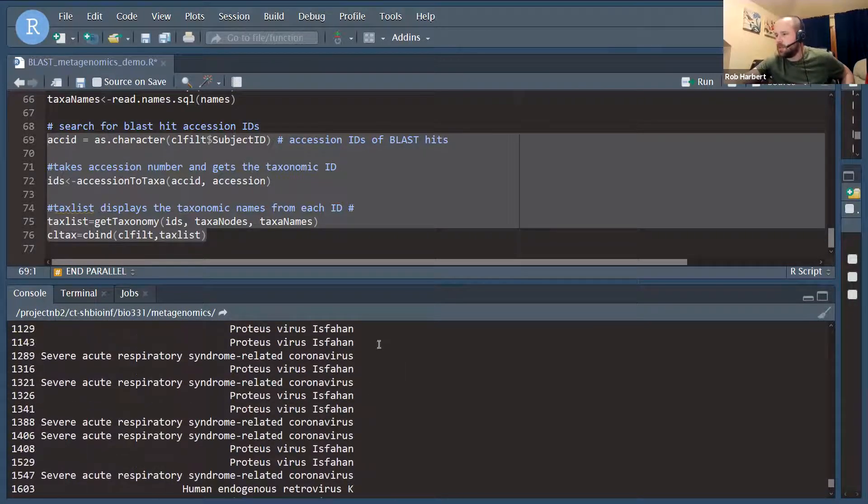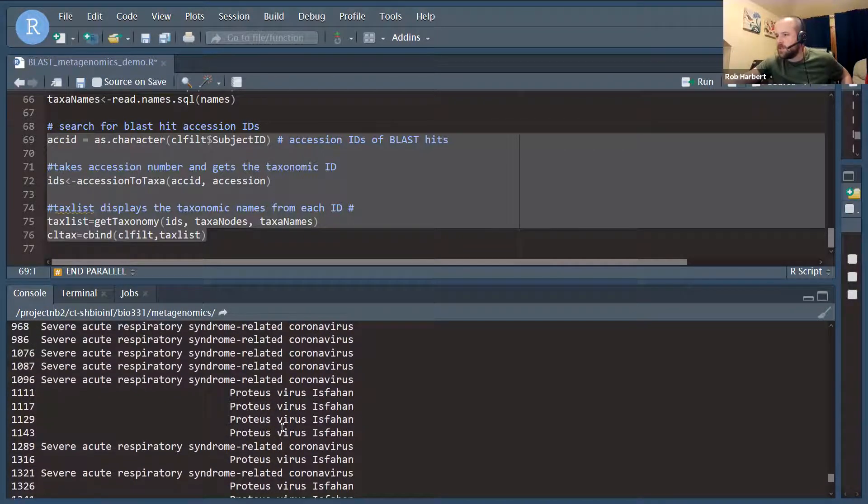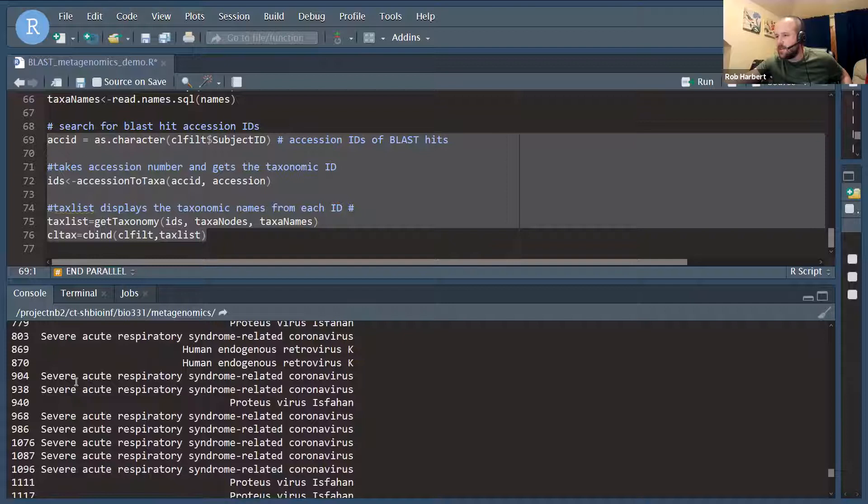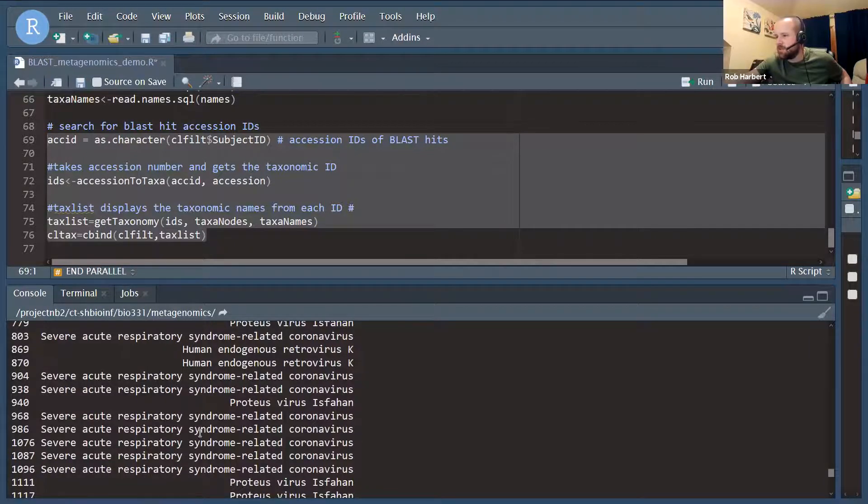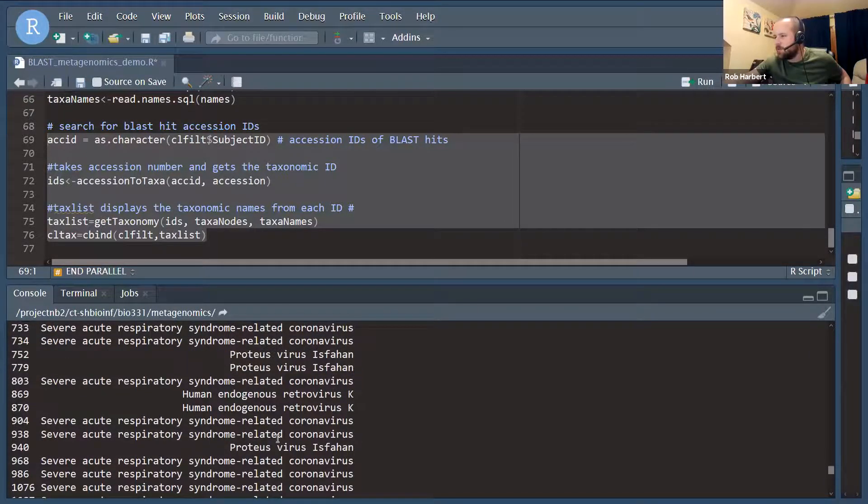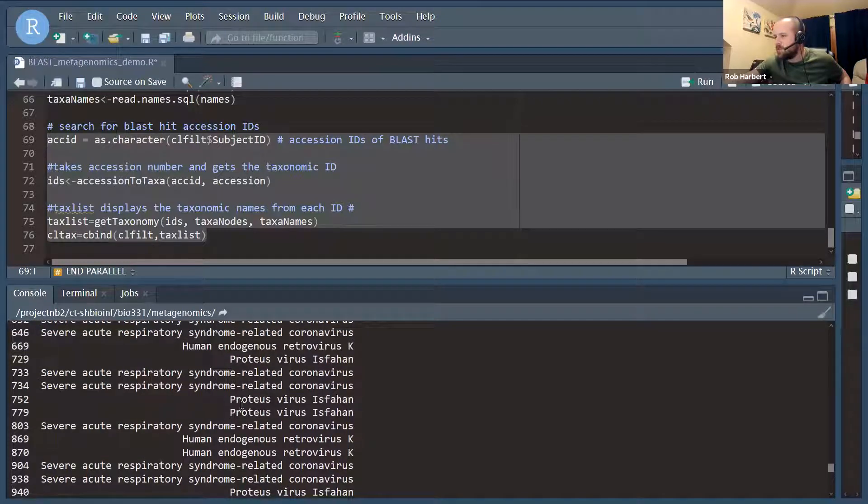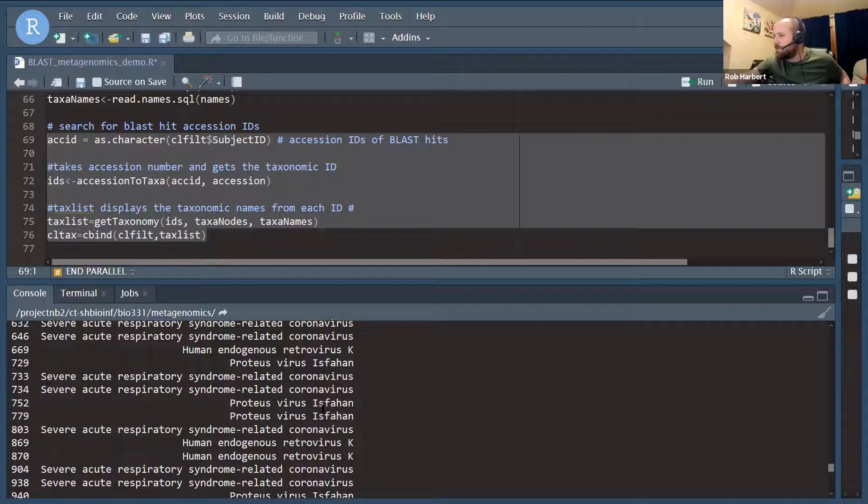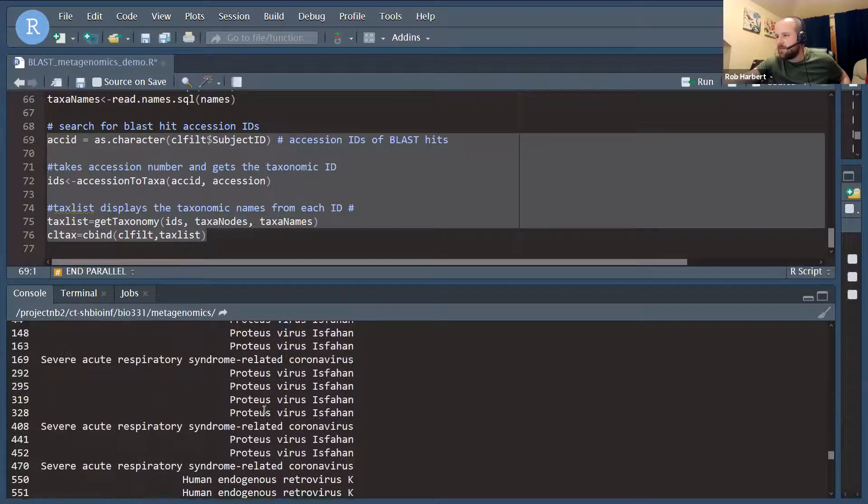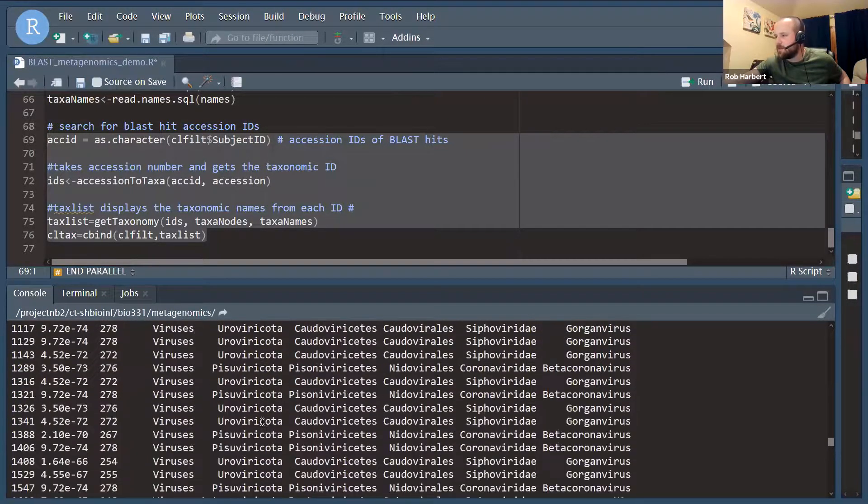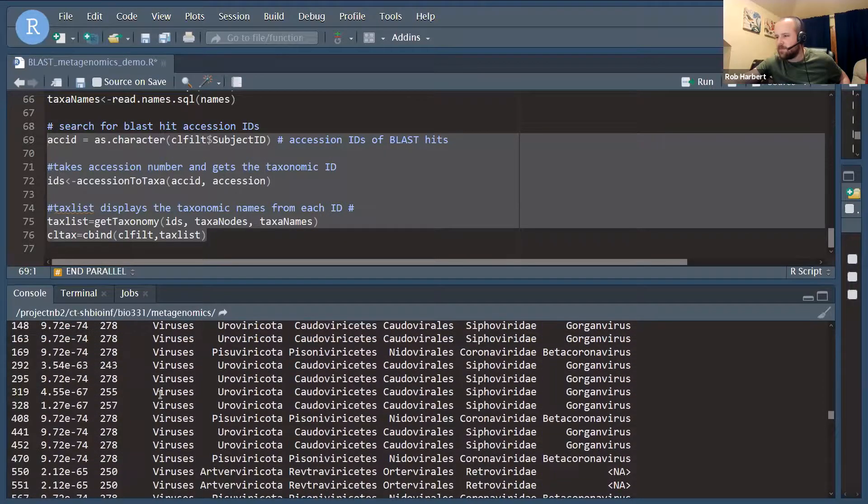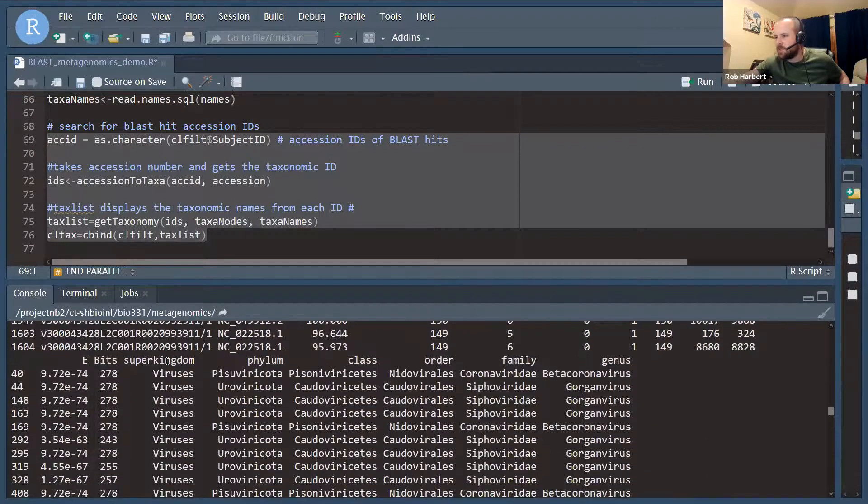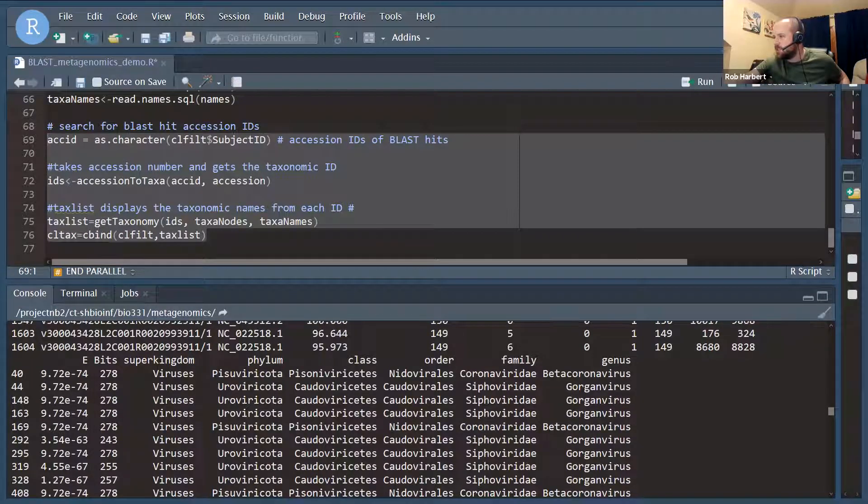Here we go. So even just printing that, we can see what our species names are. And I have a lot of hits to severe acute respiratory syndrome related coronavirus, a couple of retroviruses, this proteus virus Isfahan, which is a bacteriophage of a common non-pathogenic bacterium. So there we go. So we see the species. We also get the rest of our classification: superkingdom, phylum, class, order, family, genus.